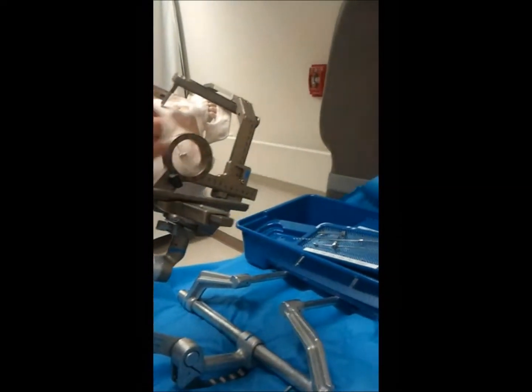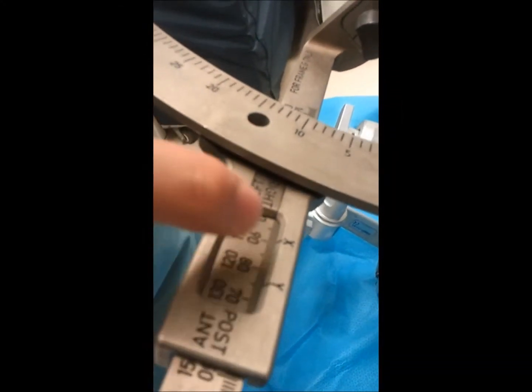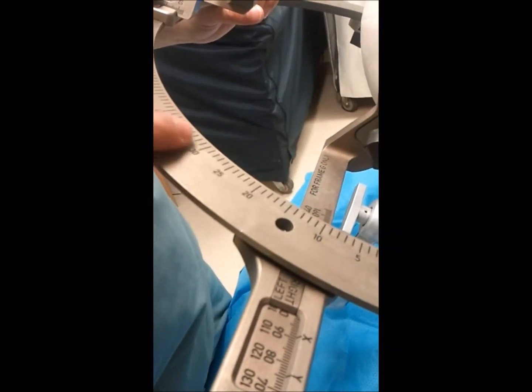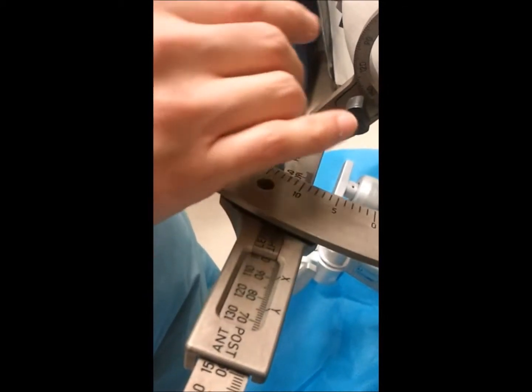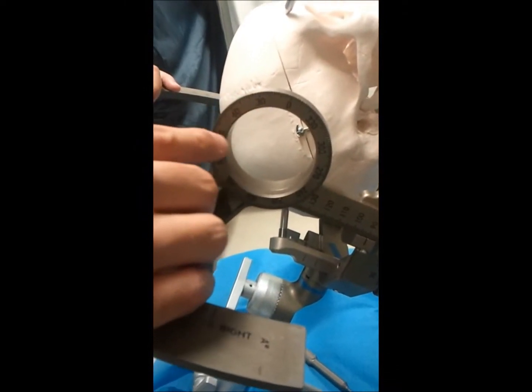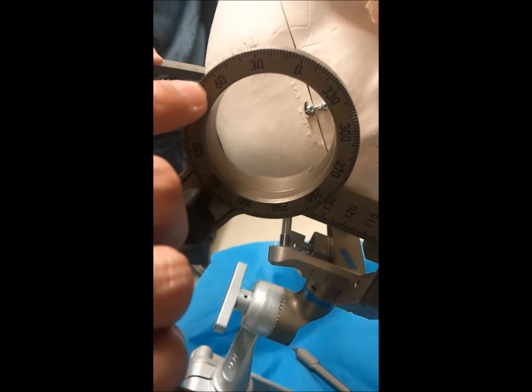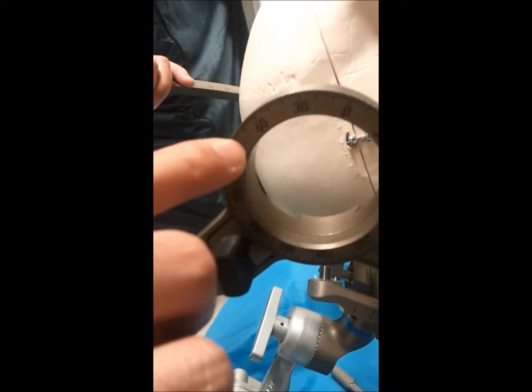And the reason I saved it for last is there's something very important to notice here. If you again notice on all the other marks that we've gone through, these are 1 millimeter ticks and 1 degree ticks markings that are on each of the reference frame components of the arc, except for this one here. As you notice, you go from 30, 60 to 90. And in between those, there's a longer line. So this line here would be 70, this line here would be 80, and then this is marked out as 90.